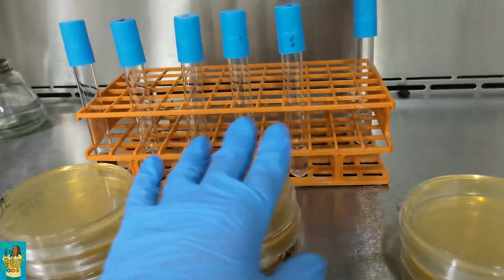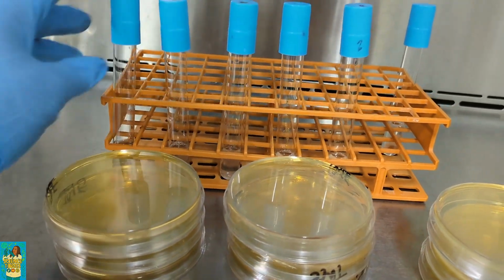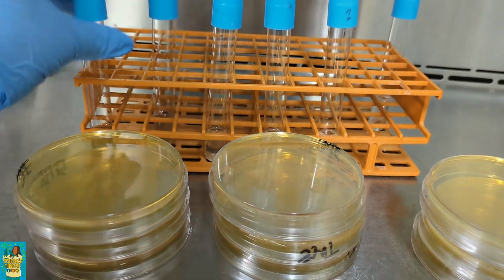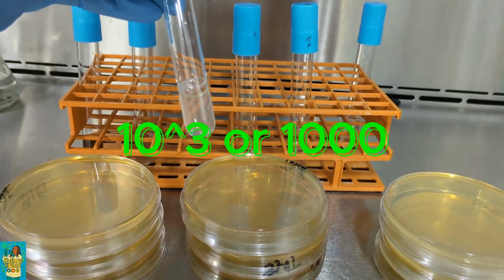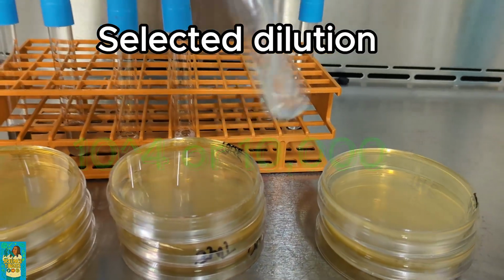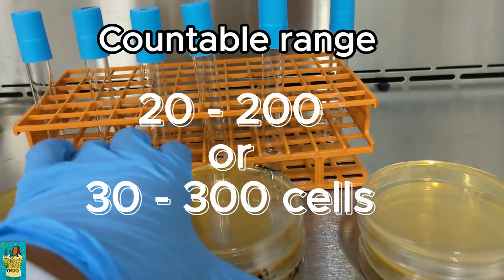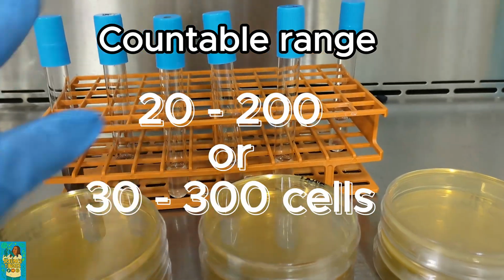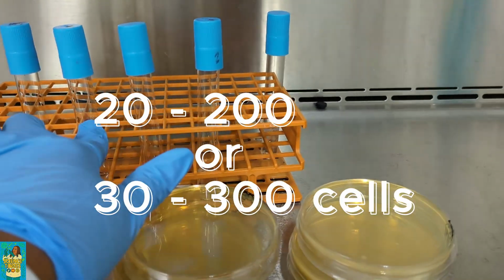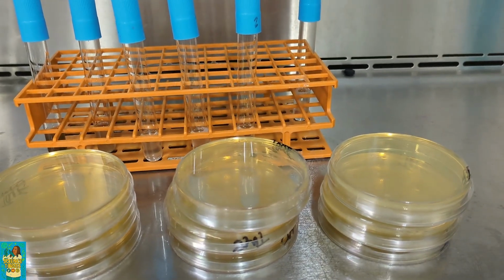I have decided, because I've done this several times, the very first one is going to be too concentrated, so there'll be too many cells that I can't count. Same with the second one. So I have decided to add the 10 to the 3, the 10 to the 4, and the 10 to the 5 dilution. The countable range is 20 to 200 or 30 to 300 colony forming units, or cells, of the particular fungus that I want, which should be present between the 10 to the 3 to the 10 to the 5 range that I can count. So you'll see me do that now.